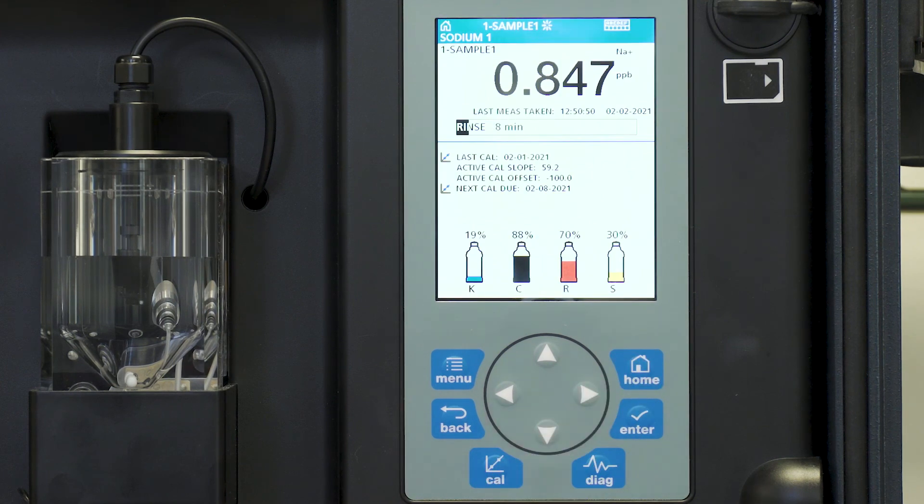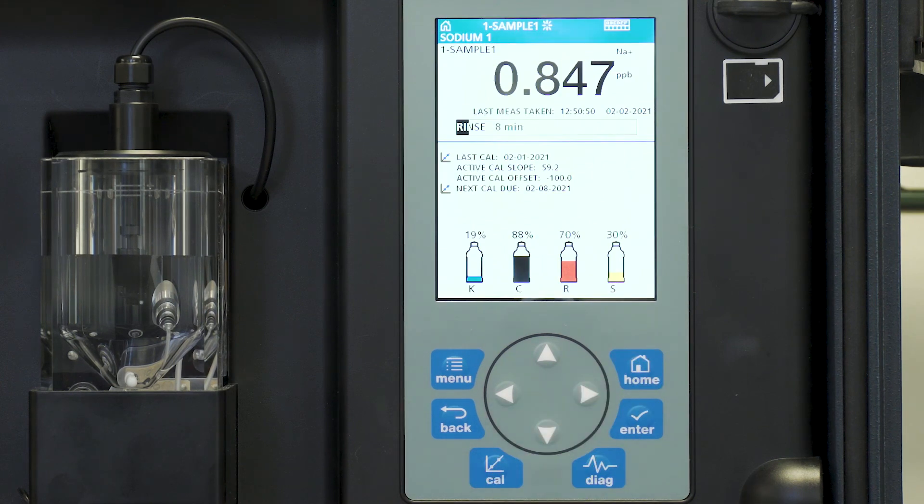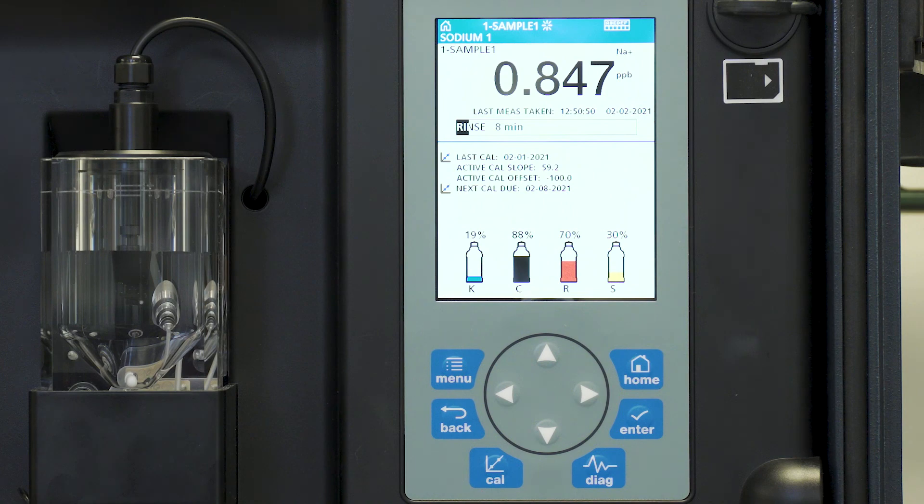Move back to the main screen. And the instrument will begin to finish its rinse and then start a new measurement.